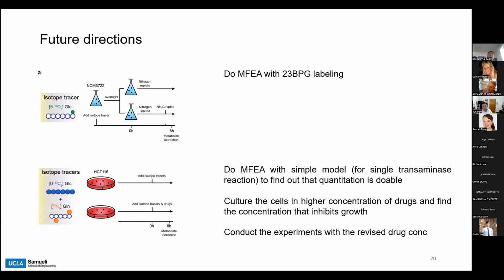For the E. coli experiments, we assumed that we were able to get enough metabolite extractions, but in this experiment, we were not able to extract 2,3-DPG labeling, which is also substantial for calculating the Gibbs free energy of E. coli. So we will do the experiments again with E. coli to get the labeling pattern of the anticipated glycolytic metabolites and calculate the Gibbs free energy further.